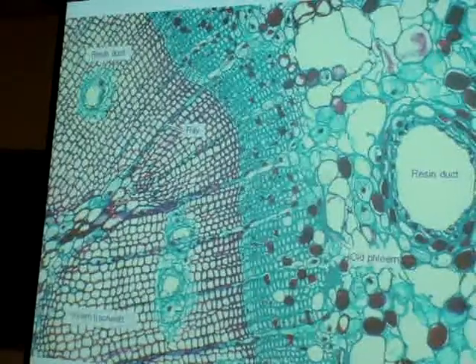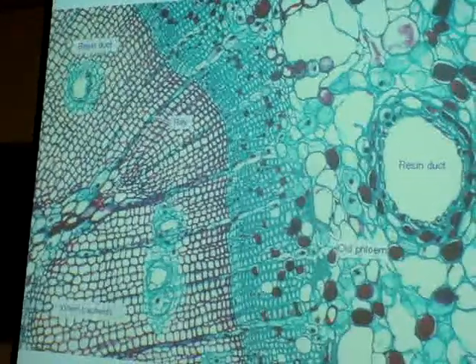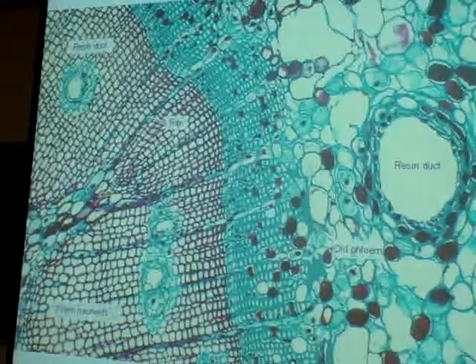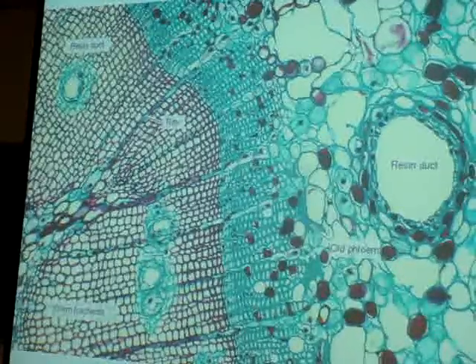Now that one's labeled tracheids. I'm not going to make you responsible for the xylem cells. I wouldn't pull the multi-tiered thing into gymnosperm. It only has tracheids. So I know some of you are looking at it going, why is it labeled tracheids? It's not. It really isn't.